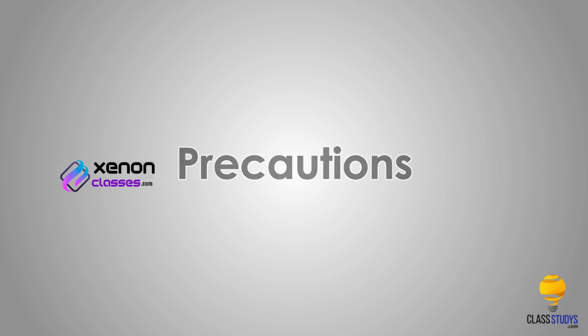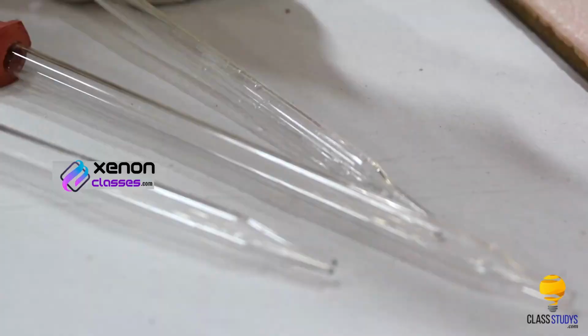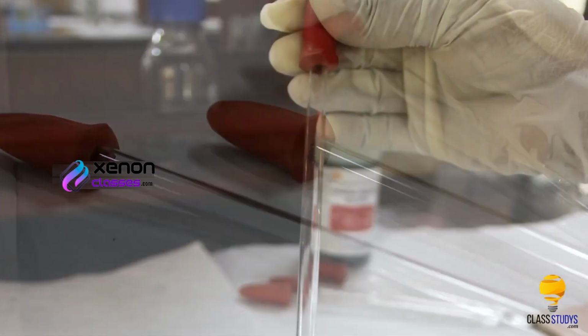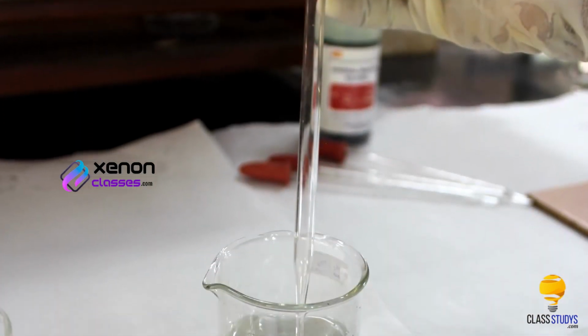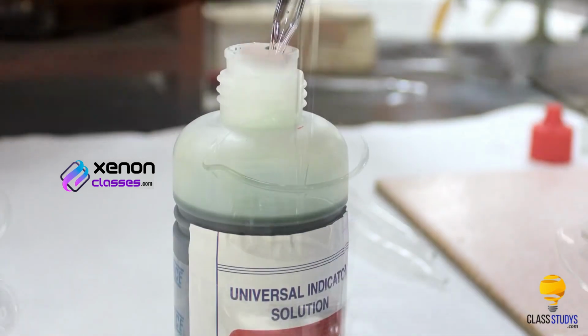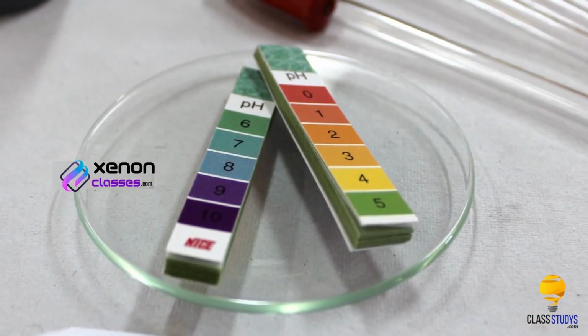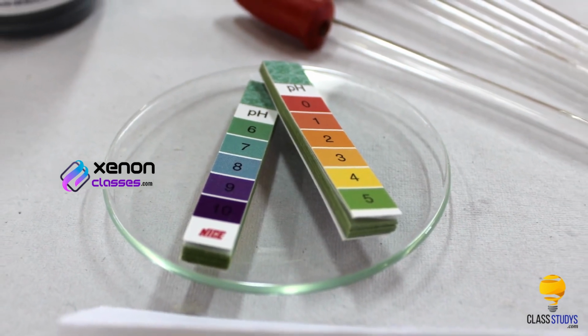Precautions: If you are using the same dropper for the test of all samples, ensure that it has been properly washed with water after every test. Make sure that the pH strips are kept away from chemical fumes.